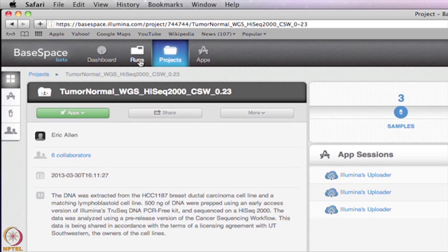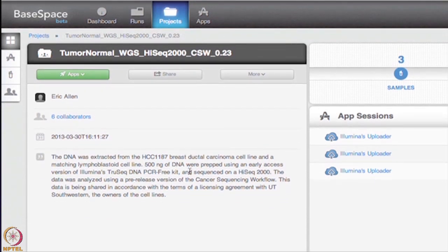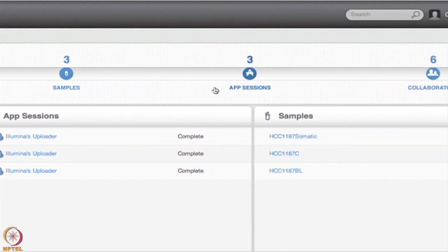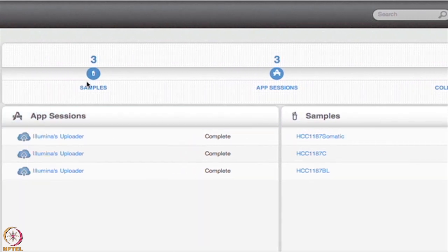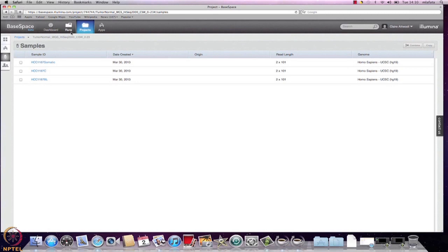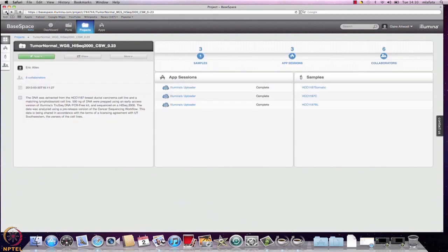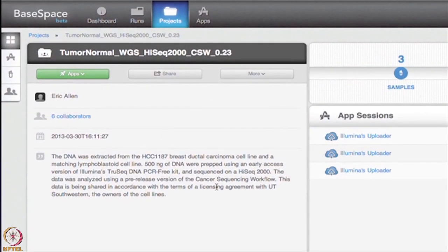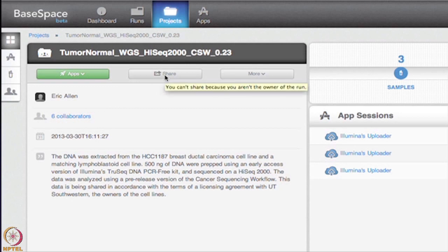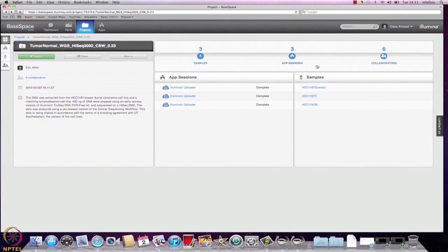In contrast, a run in BaseSpace corresponds to data from sequencing a single flow cell on an instrument. The project overview page contains a brief description of the dataset. You can navigate around using the quick launch buttons, either using the buttons on the left tab, using the names, or the direct links — these all link to the same place. The collaborators button indicates who the run has been shared with. If you are the owner of a run or project, you can change the name and transfer runs or projects to collaborators. The share button allows you to share your projects, though you cannot share this project since we are not the project owner.